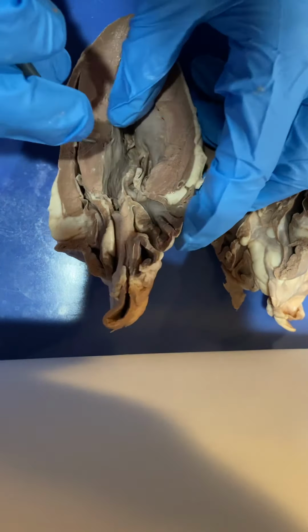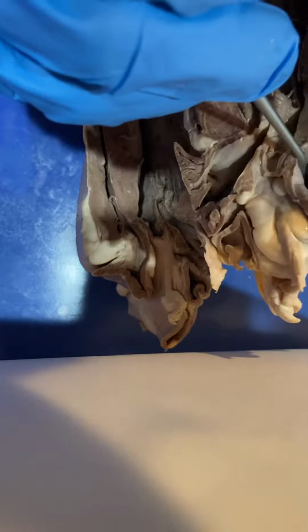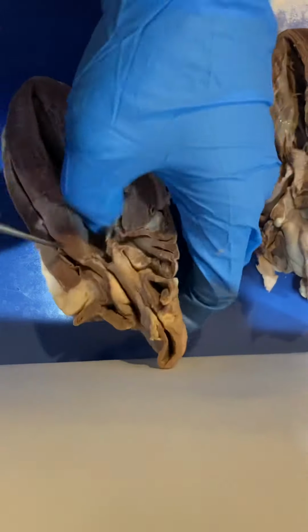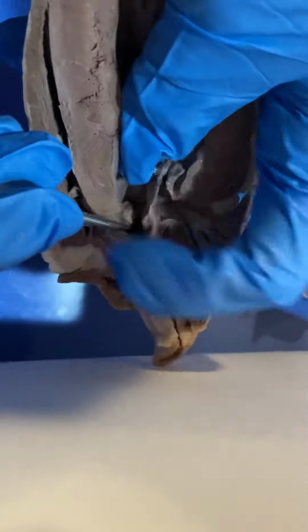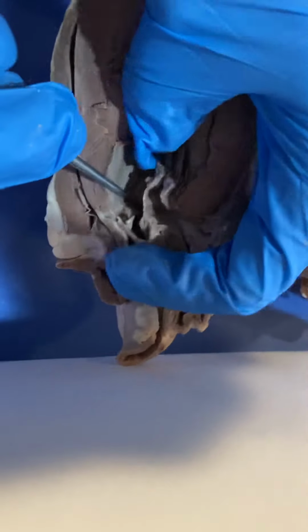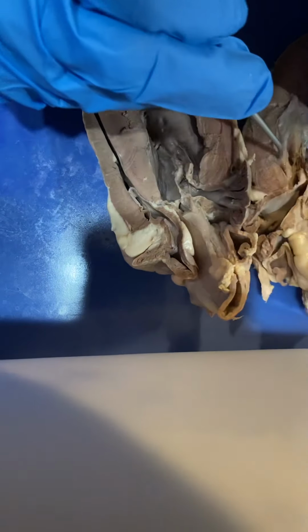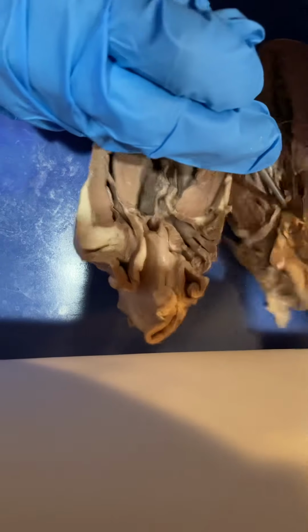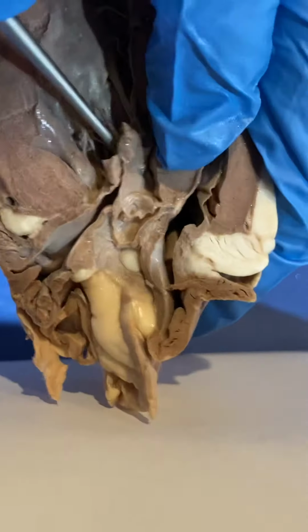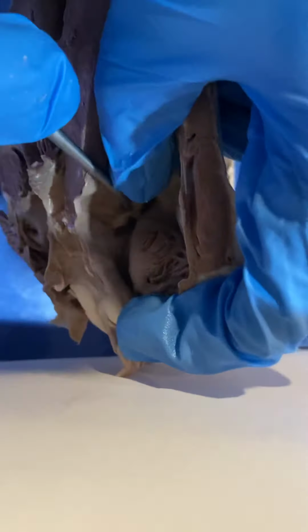Some other things that you are going to notice is the semilunar valve. Now this valve is going to keep the blood from flowing back into the different ventricles and the different atriums, which will prevent heart murmurs. So this might be a little harder to see, but this is going to be the semilunar valve right here. You can see it's going to keep the blood from going back. And then on this one, it's going to be a little harder to see on the side. But this one is also going to keep it from going back. It's inside here pretty deep, but you can kind of see it right there.